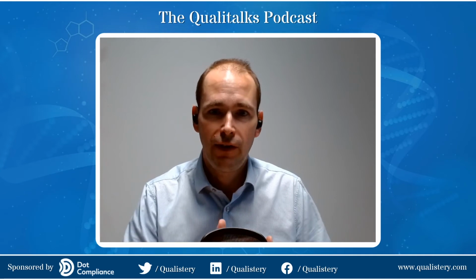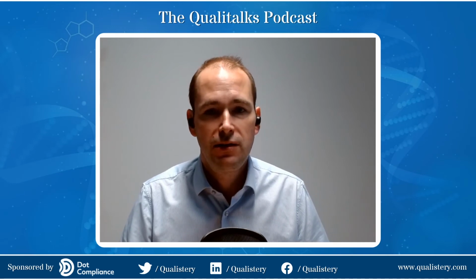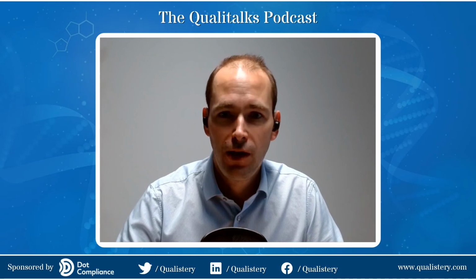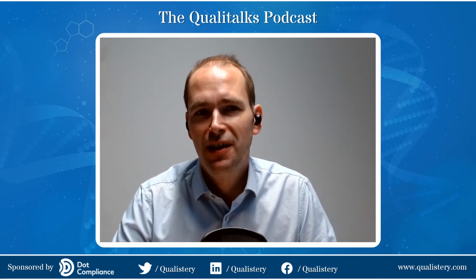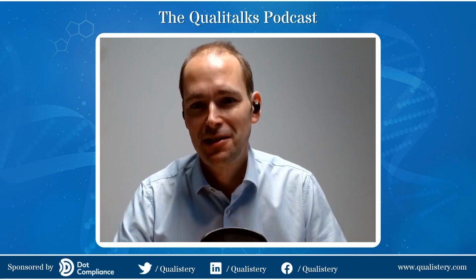So that would be looking at vacuum pulses, at any additional drying cycle that we can add, any overpressure. So that might be putting additional services onto the autoclave, like hot air or compressed air. It might be having cooling water to the autoclave, just to enable us to cool loads, to remove air, and to dry loads. So it's something that's very difficult to retrofit. So we can do that at the URS stage because we can anticipate it, I think. Right.